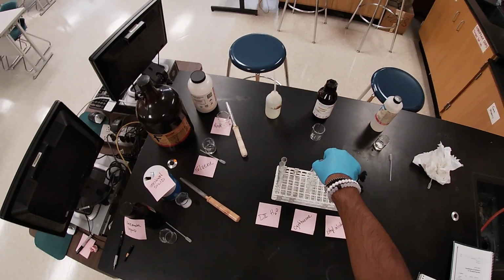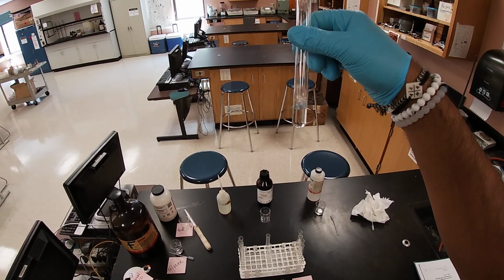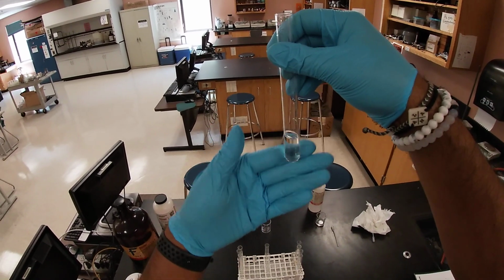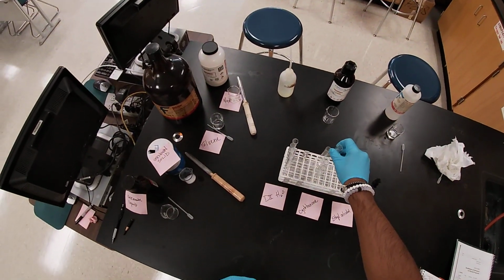Let's look at a second one. So toluene is not soluble in water. Now let's check cyclohexane. And if you notice, there is no layer here. So that means that toluene is soluble in cyclohexane.